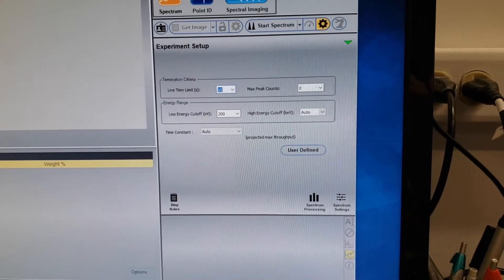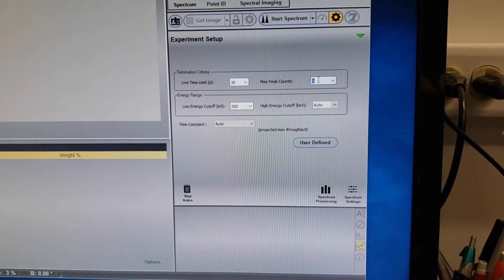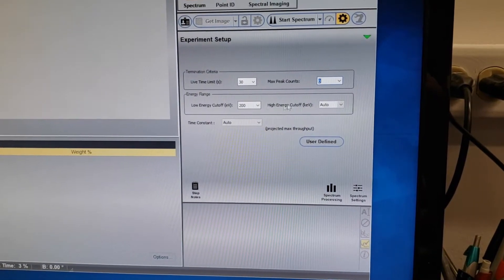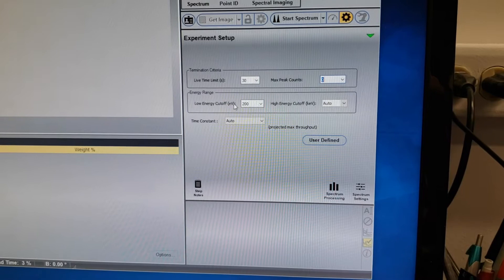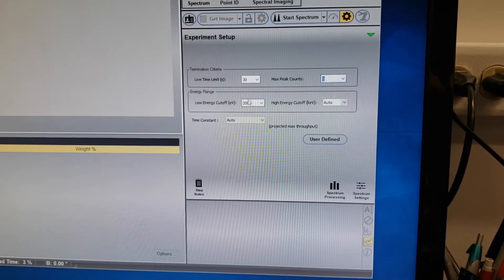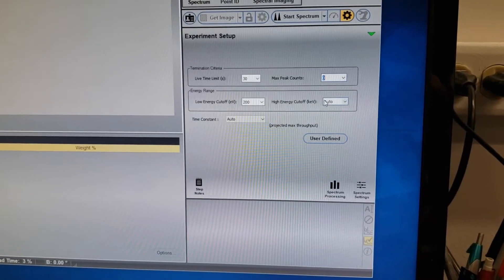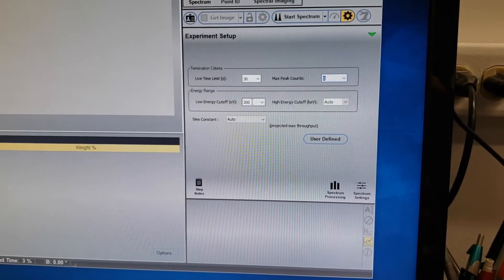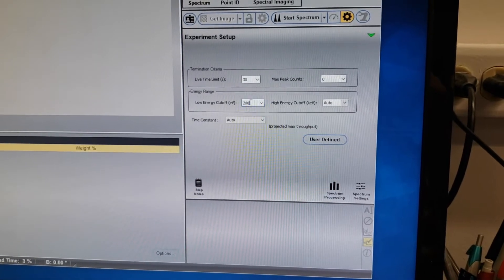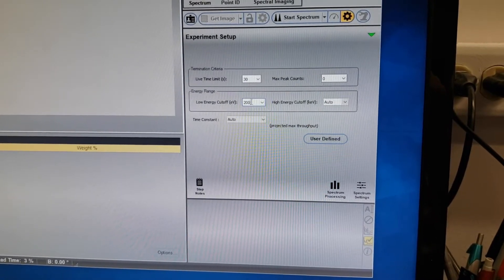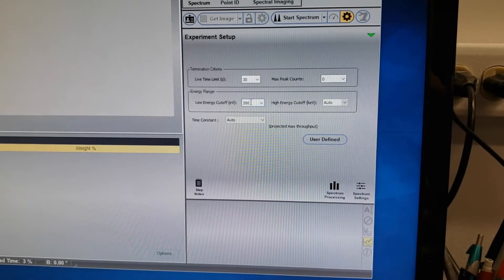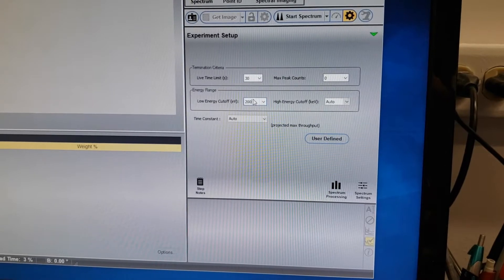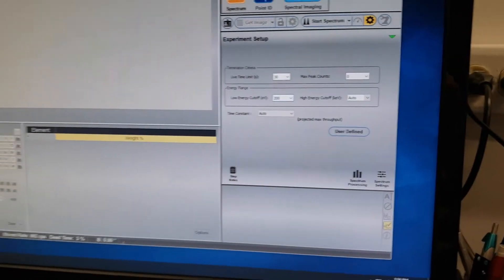For speed of training, we're going to do just 30 seconds on each scan and set max peak counts to zero. Next, we'll look at our energy range — the x-axis will go from 200 eV up to auto, which is our default. You can go a little bit lower than 200 eV if you're interested in seeing boron, since boron's peak happens around 183 eV.